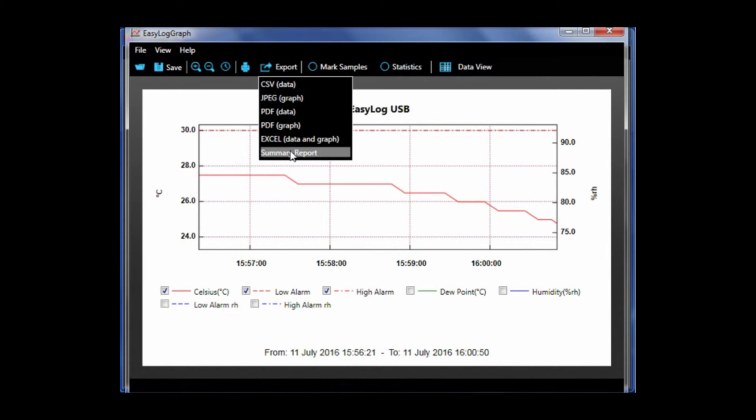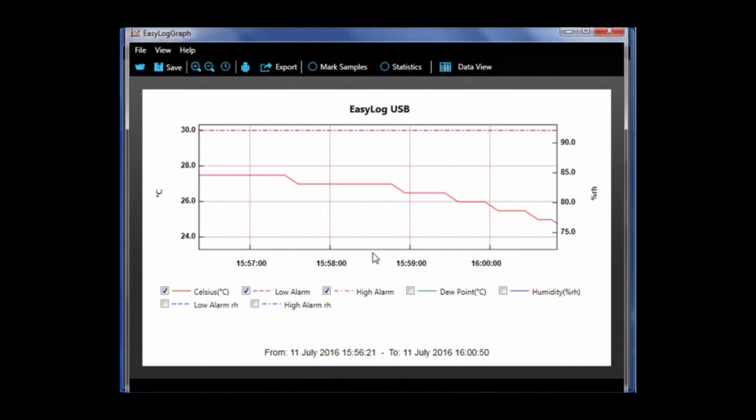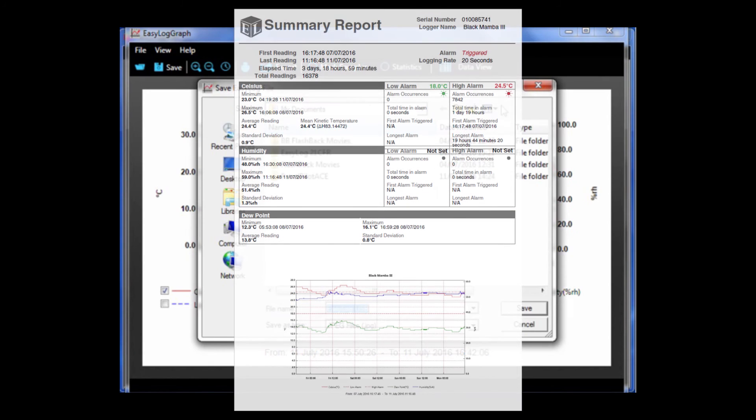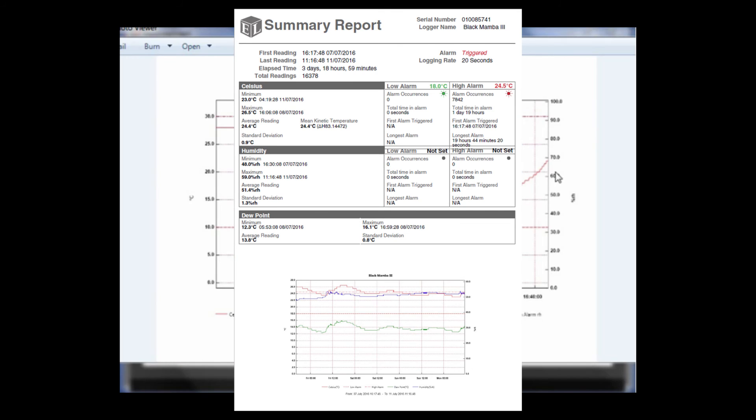The last export item is a summary report. A PDF based overview of the logging session in a non-editable format showing the average statistics for the entire logging session including alarm occurrences.